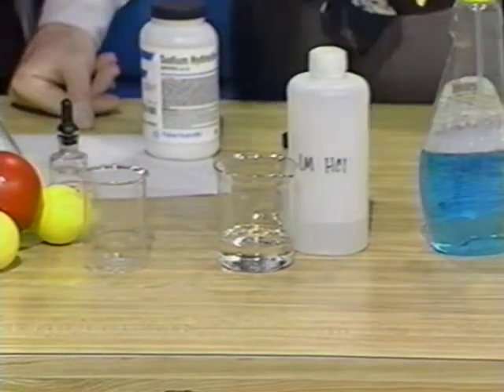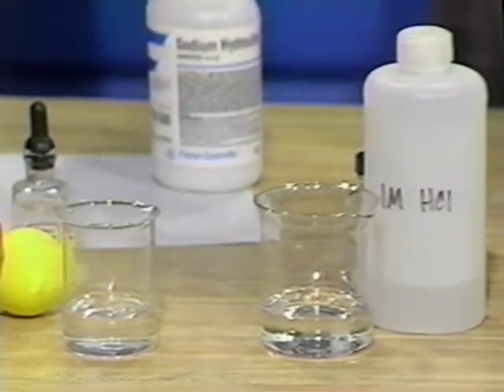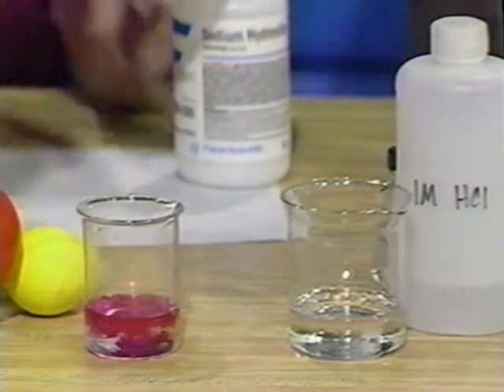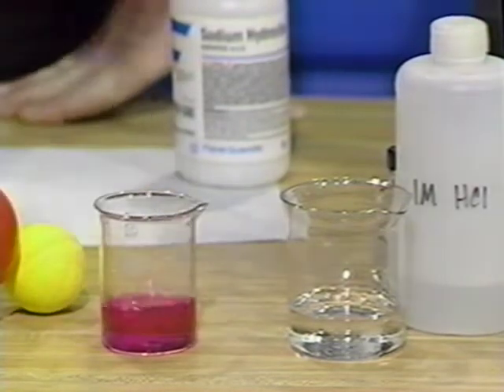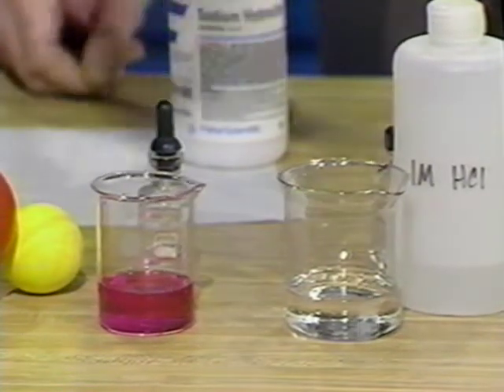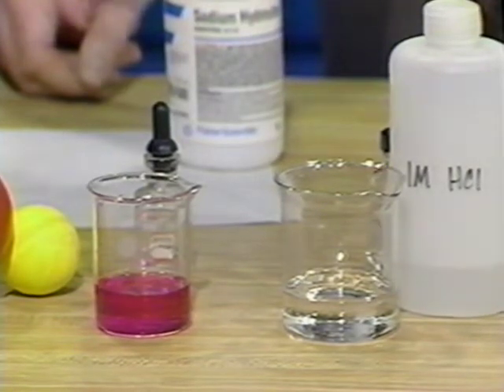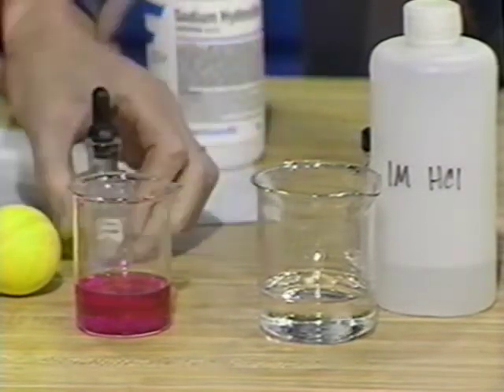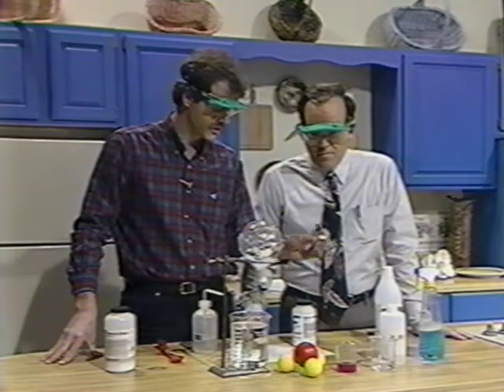Now we can take some ammonia and put it into this beaker. We'll put a few drops of phenolphthalein in there and — it turns pink. That's because ammonia is a base. All aqueous solutions of ammonia are basic. The phenolphthalein stays colorless in acidic solutions but turns pink in basic ones, so it can tell us whether we have a basic solution. If you're checking for ammonia, not only is the odor there, but you can try this color test.